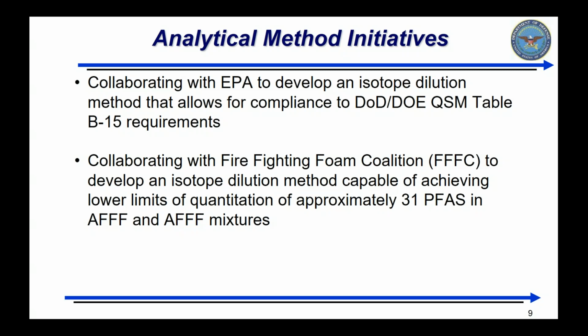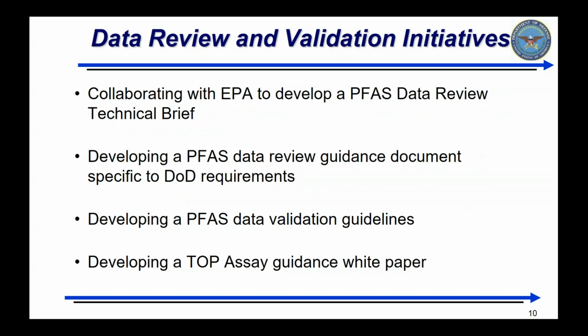So I've talked about PFAS sampling and analysis. What about the data generated for those efforts? Is it fully understood and how to properly evaluate this data? Are the advantages and limitations of various evolving methods understood? From the EDQW's outreach efforts, there appears to be a need for some guidance on data review and validation, as well as understanding evolving methodologies.